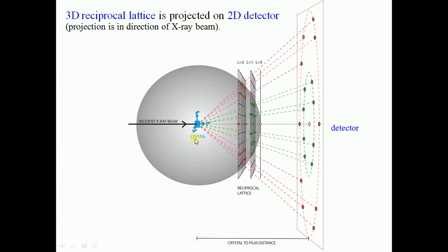And this image I have taken from Laue diffraction because the incident radiation is X-ray. Instead of X-ray, now we have electrons here, but it is a very similar type. This is the reciprocal lattice, and we know only at important locations the Bragg's condition is satisfied, and there only X-rays are allowed to interfere. Similarly, the electrons form the spotty pattern in 2D projection. Is it not?